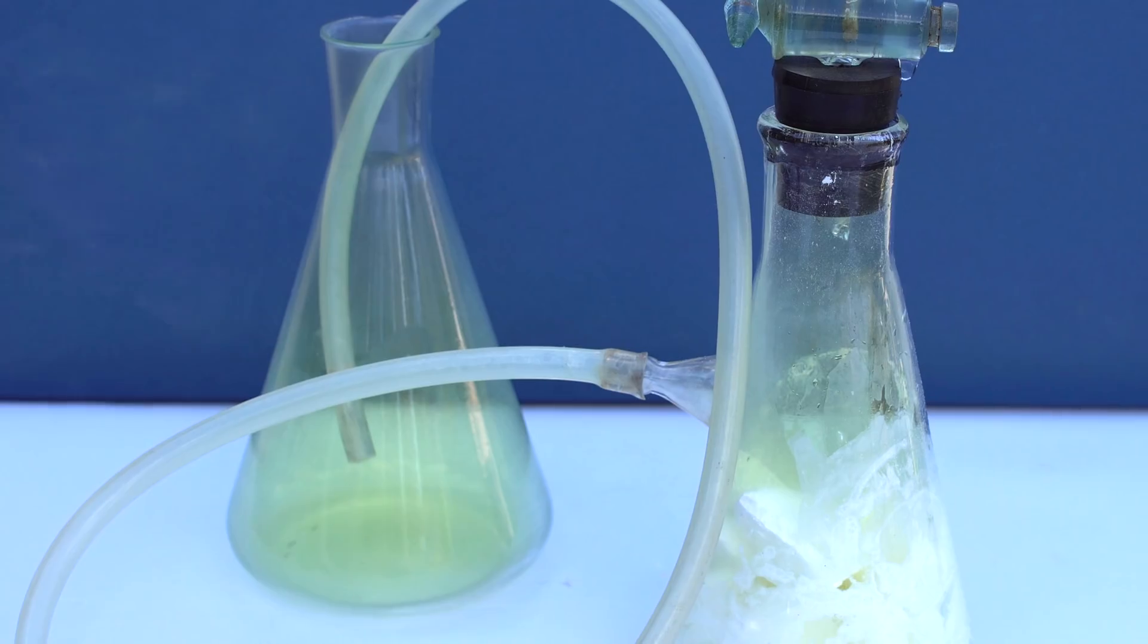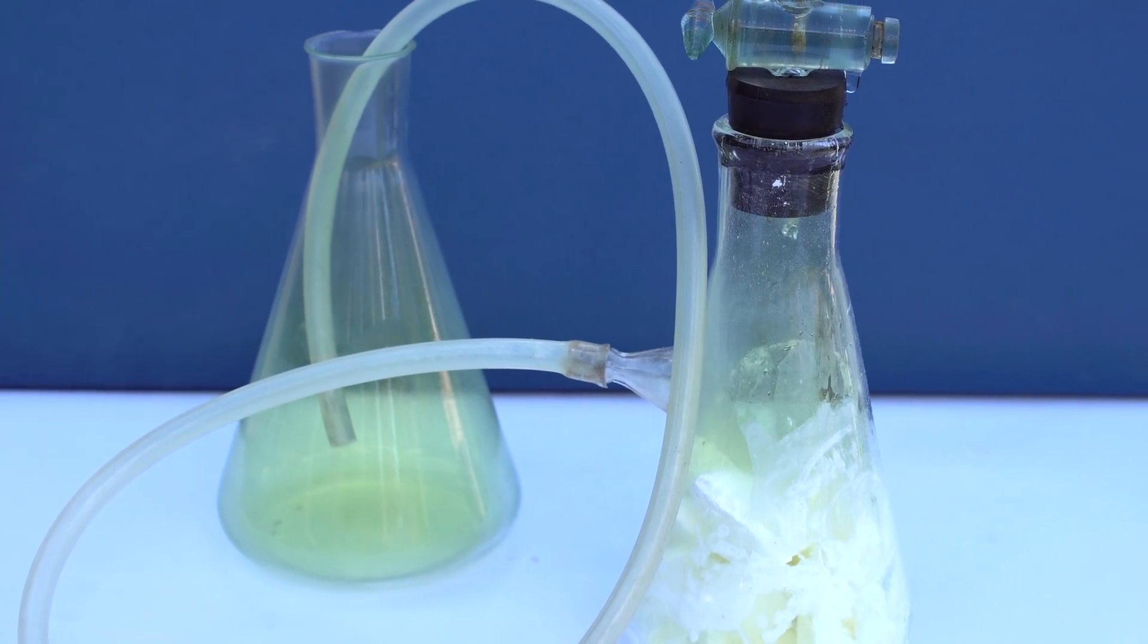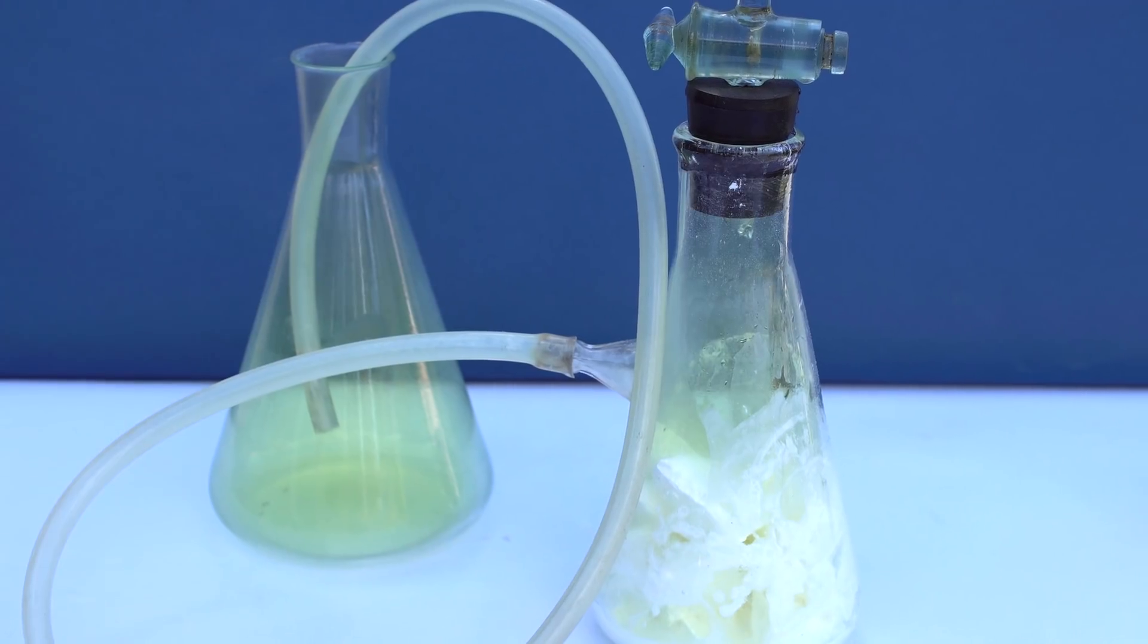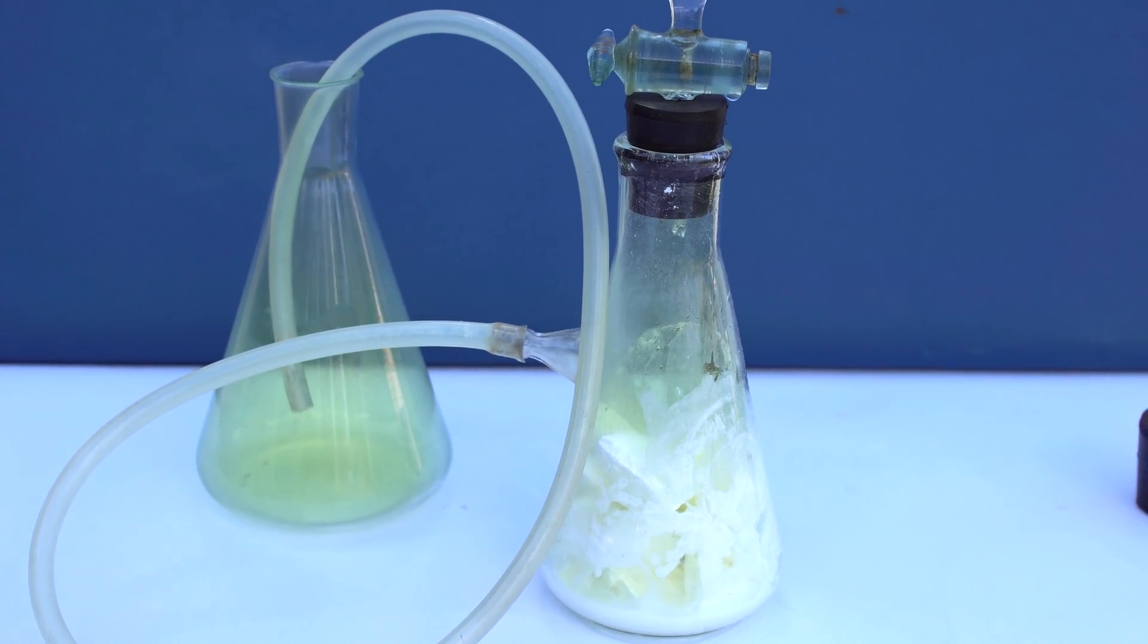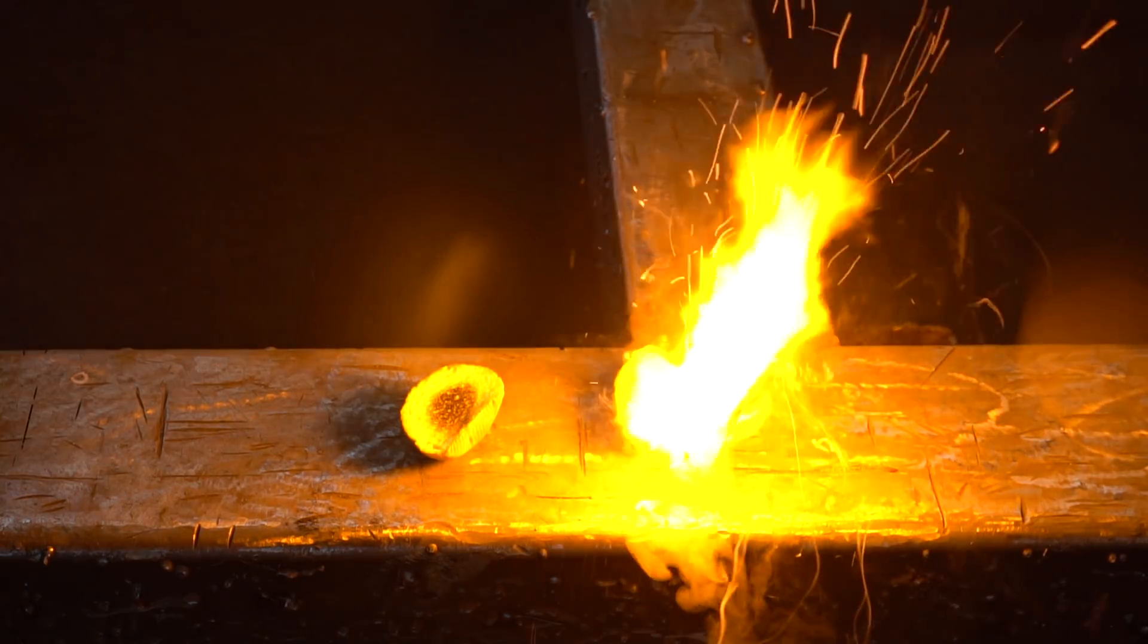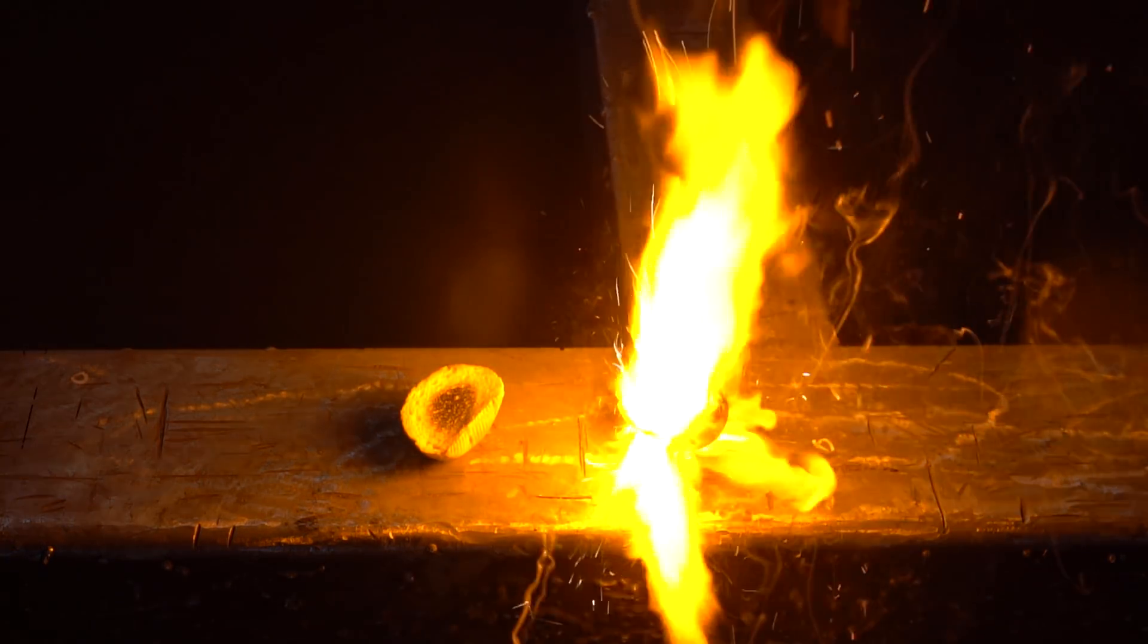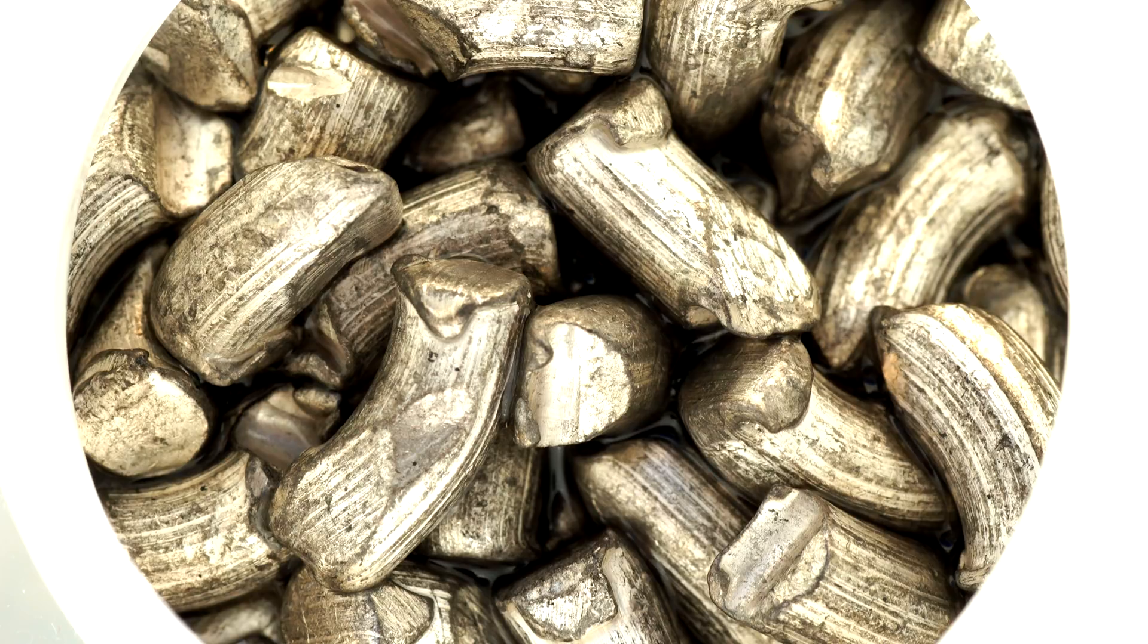After filling out the flask with chlorine, we can now observe which properties this gas possesses. From the chemical point of view, chlorine is a powerful oxidizer, that is, it can easily take away electrons from certain substances, for example, metallic lithium.